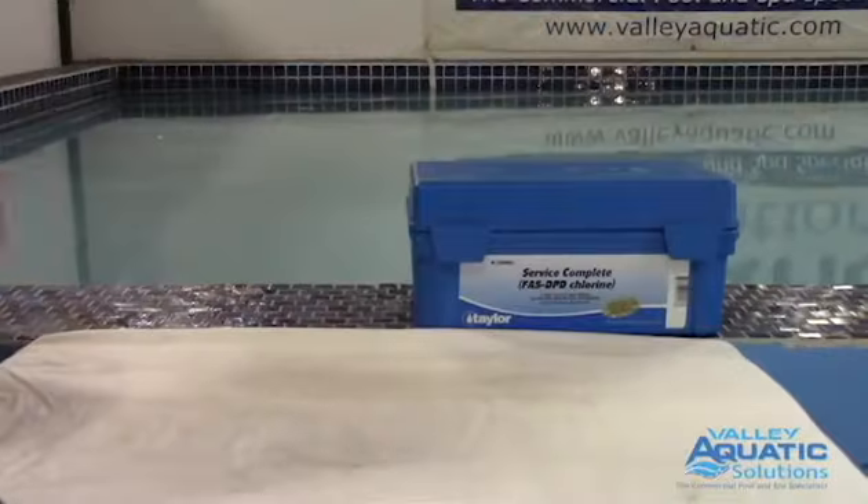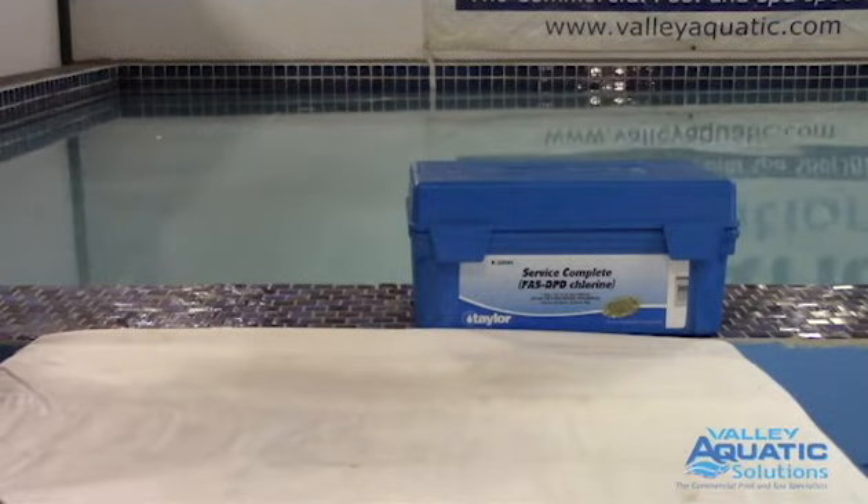Hi, my name is Ken Walther from Valley Aquatic Solutions. Today we're going to talk about using the Taylor test kit. I'm going to show you how to test for free and combined chlorine using the Taylor 2006c test kit.